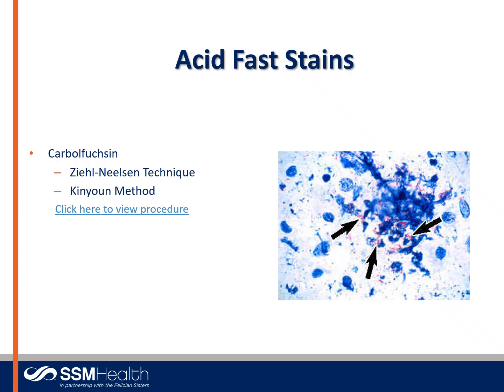And in the Ziehl-Neelsen technique, the carbolfuchsin is heated to drive the stain into the cell wall of the Mycobacterium. This is no longer used often in a routine microbiology lab. Heating of the carbolfuchsin is not the most practical. So now it's much more typical to use the Kinyoun carbolfuchsin method.